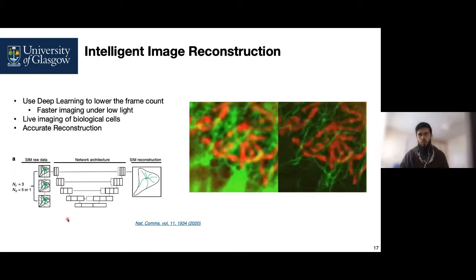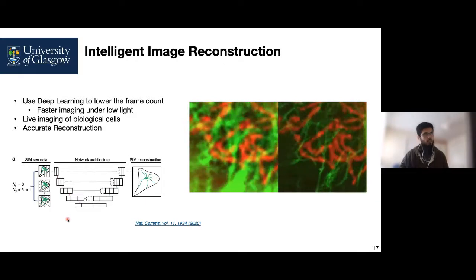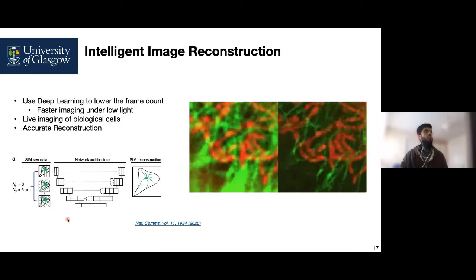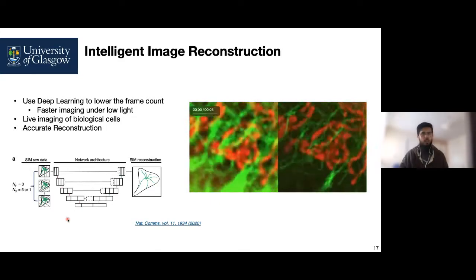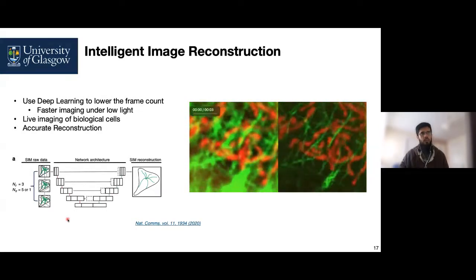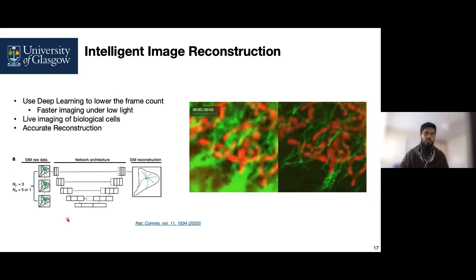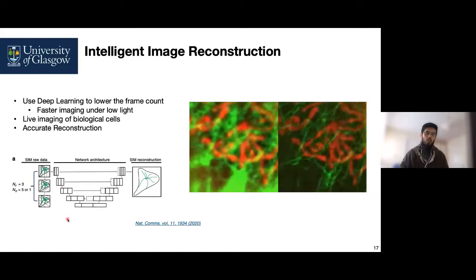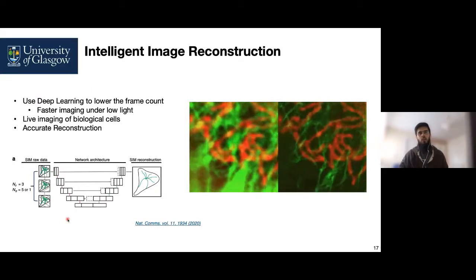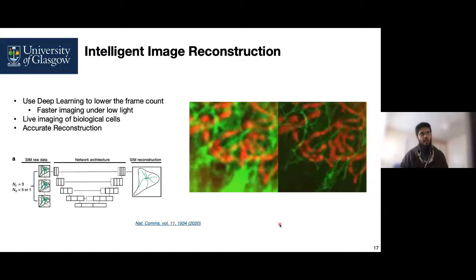Now, in this paper, they have created a library of structured illumination microscopy images through which they have trained their deep learning model, which is based on a neural network. Once they have trained, they can reconstruct structured images which require many fewer sample images for reconstruction. So this is one of their demonstrations.